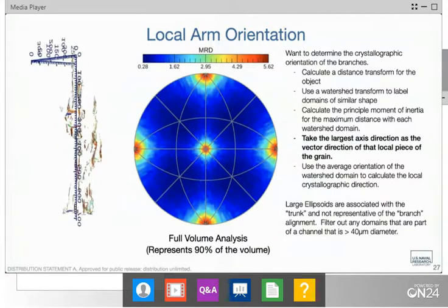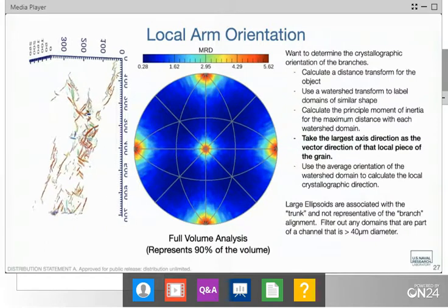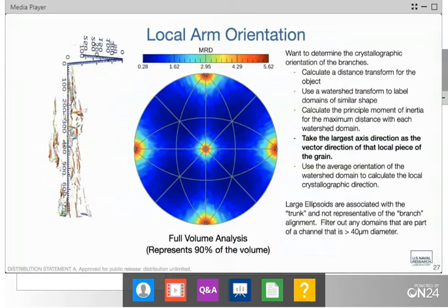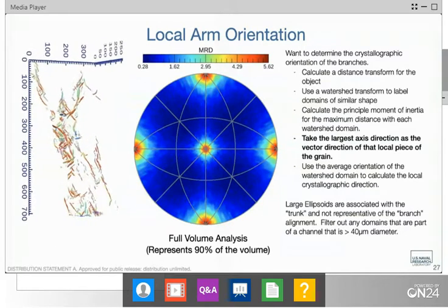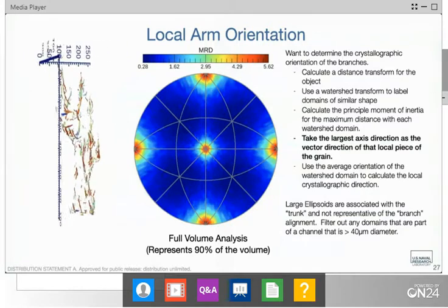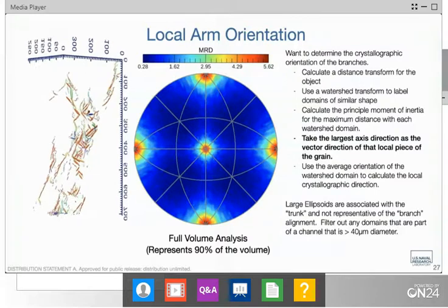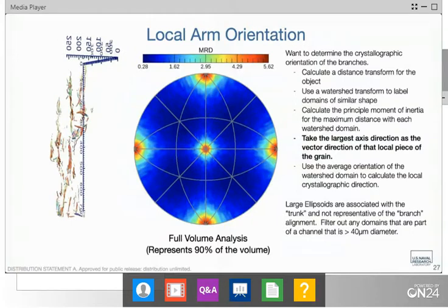Are you sure that these large areas are grains? That's a very good question. My recent TEM studies, I think, get to what I just talked about. They might be several separate grains that grow almost epitaxially on top of each other. If you look at the detailed formation, there are these cellular structures. We think this is happening from a cellular solidification standpoint, where you get some segregation between what would be dendrites, but they don't really have time to develop arms of the same orientation. And we think they very much are growing epitaxially from layer to layer.